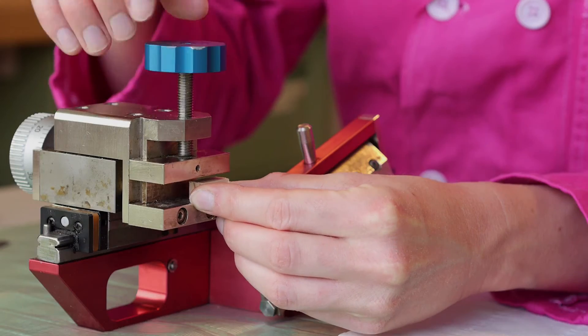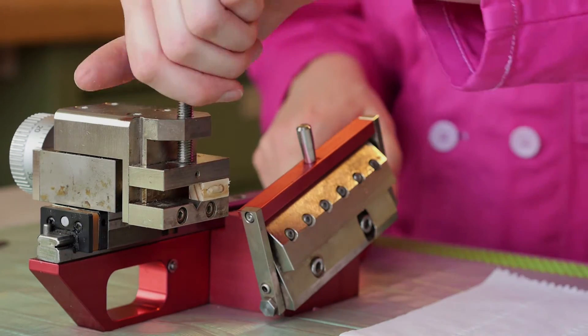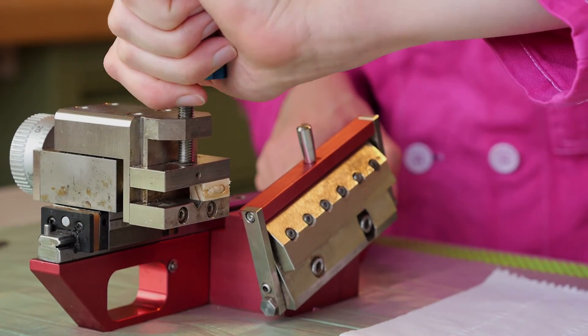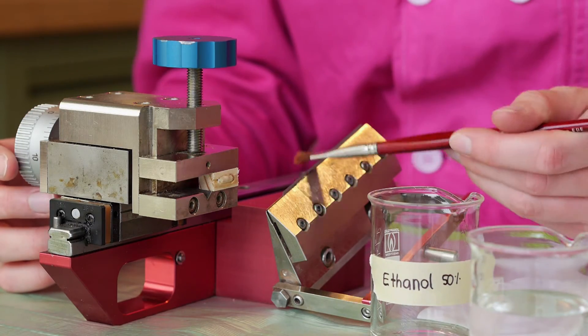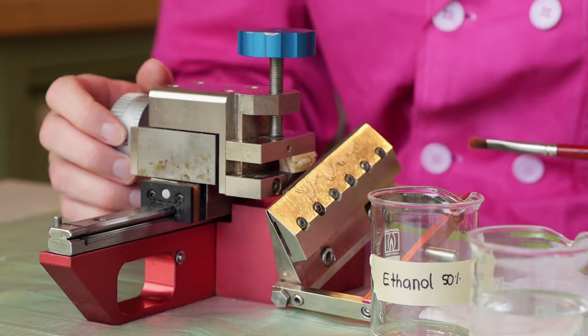Clamp the sample with the wooden holder into the microtome. Take care that the bark points towards the knife — this will prevent the bark from breaking off during cutting. Brush the sample and the knife with 50% ethanol or water before every cut.